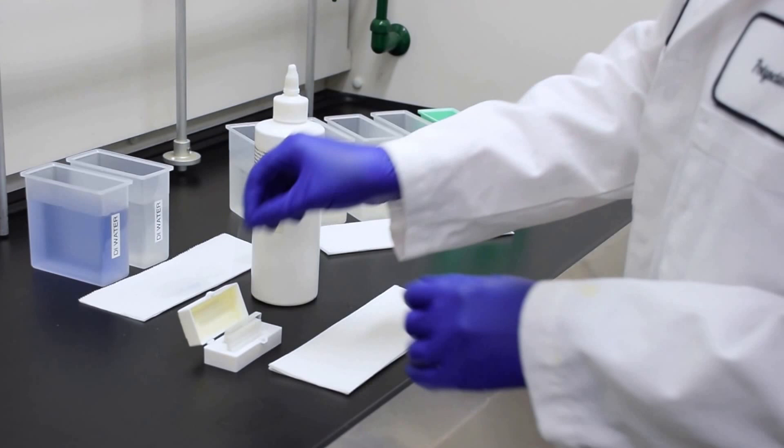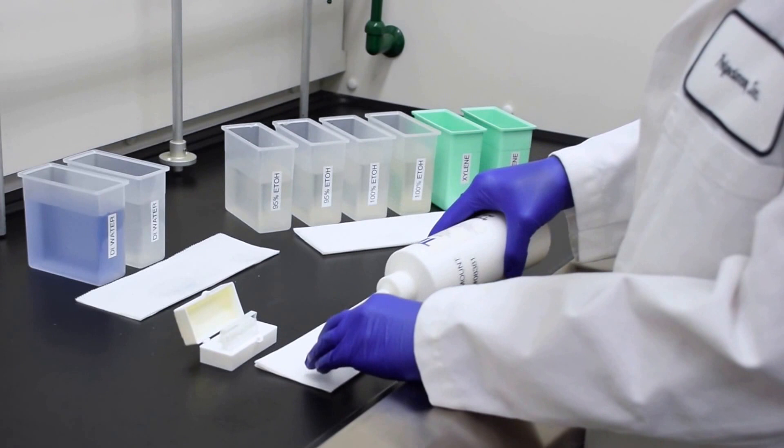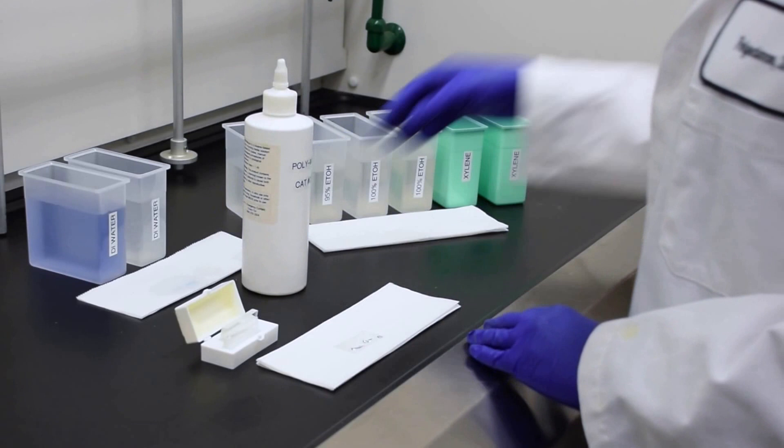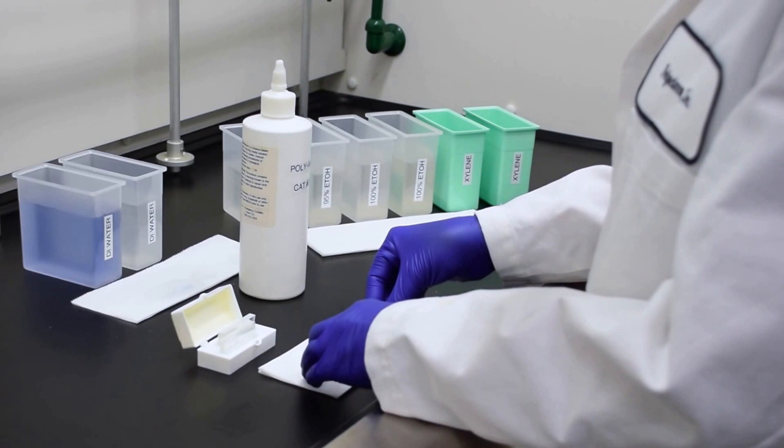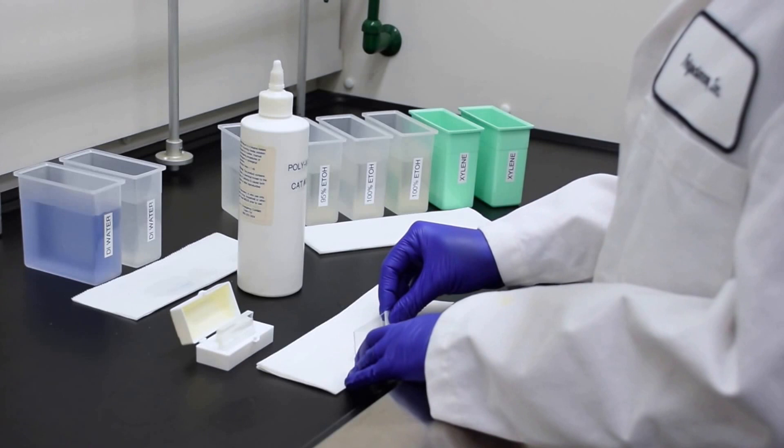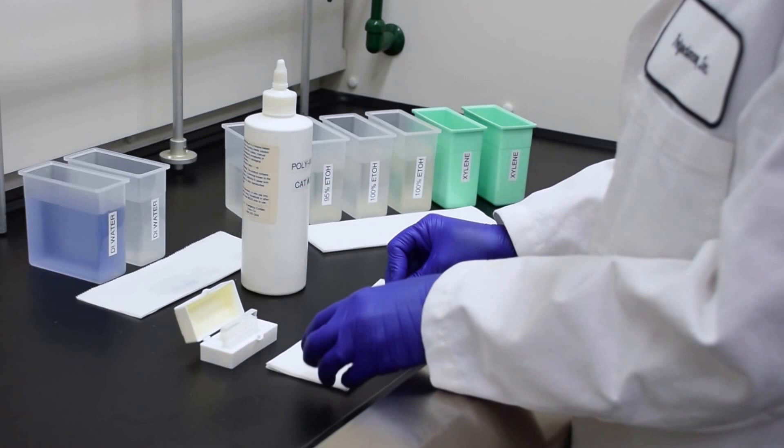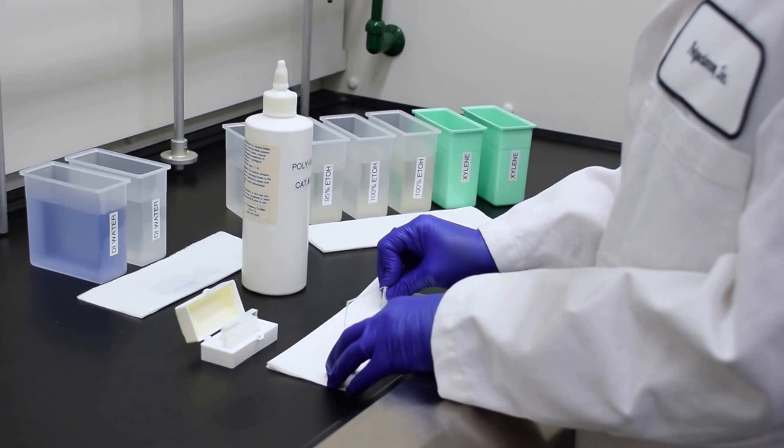Taking a glass coverslip, apply your polymer mounting media to the coverslip. Remove your slide from the xylene and carefully mount your slide, removing any excess mounting media.